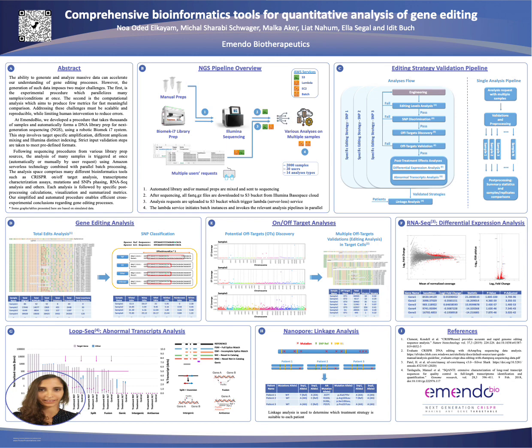To achieve the optimal gene editing solution for each disease, we use protein engineering to create the best nuclease available for each specific indication. In order to validate each specific editing strategy, the researchers perform many assays ending up with high-throughput sequencing, and we in the computational team help them draw conclusions by analyzing the massive data and outputting relevant statistics and visualizations. To do this, we develop a framework for the researcher to submit analysis requests, which trigger the relevant analysis pipeline and output results to a specific location.